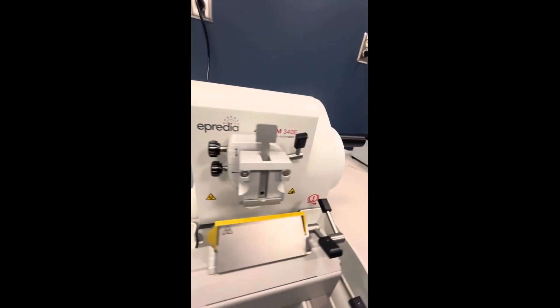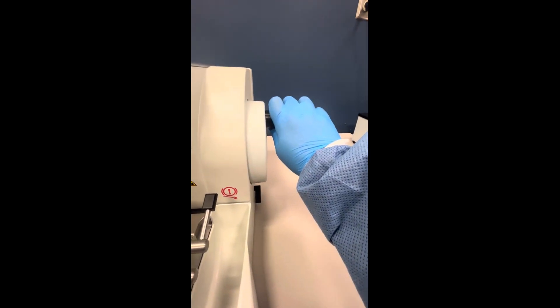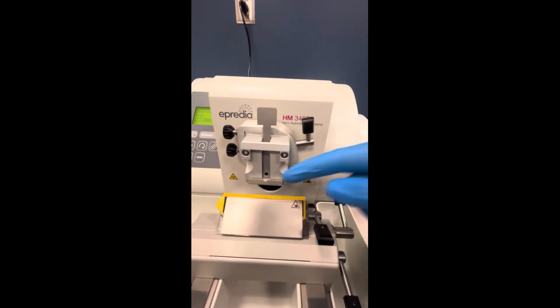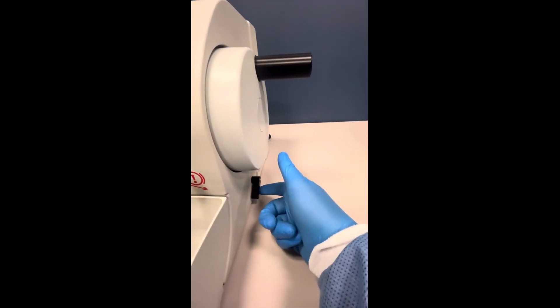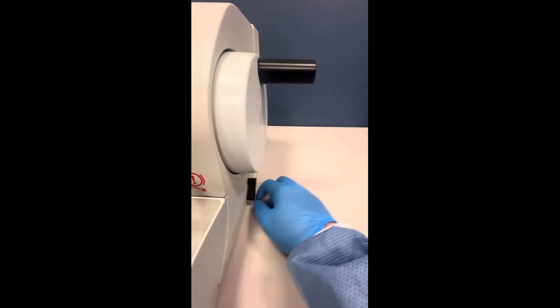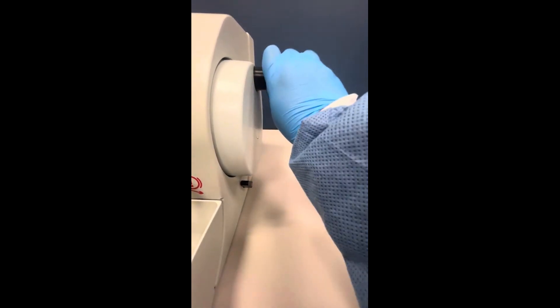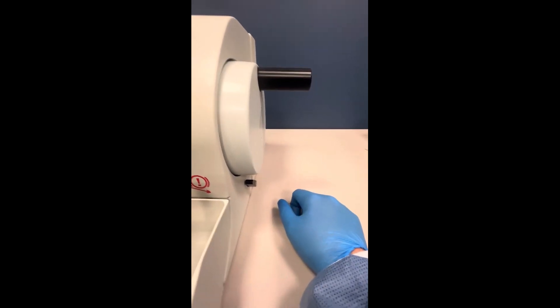We have our handwheel here, and this actually moves the specimen forward towards that blade. There is a handwheel brake on this side — one rotation, rotary. This locks it, so that prevents you from making any motion with this rotary wheel.